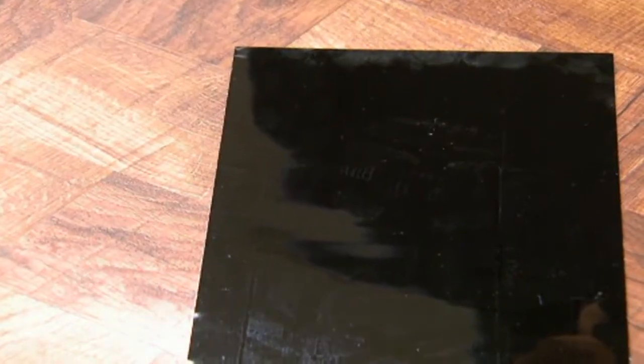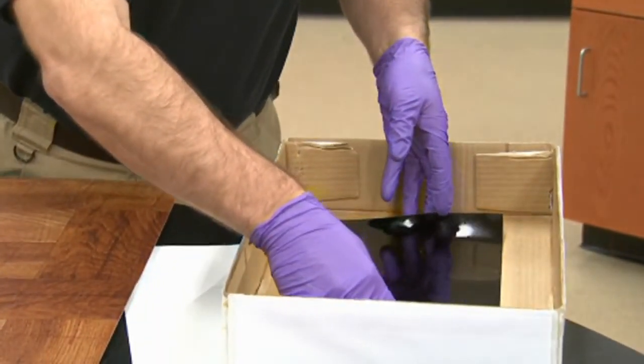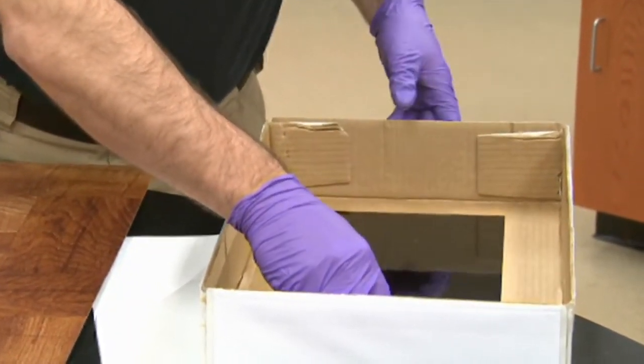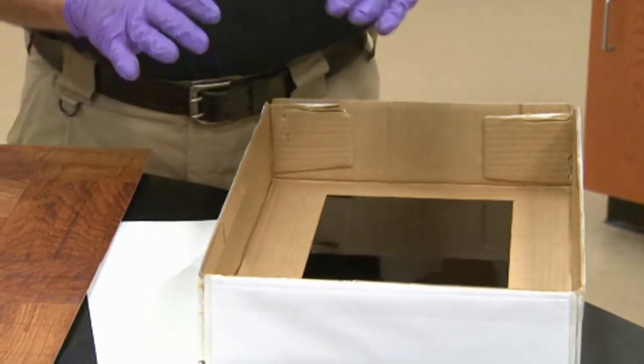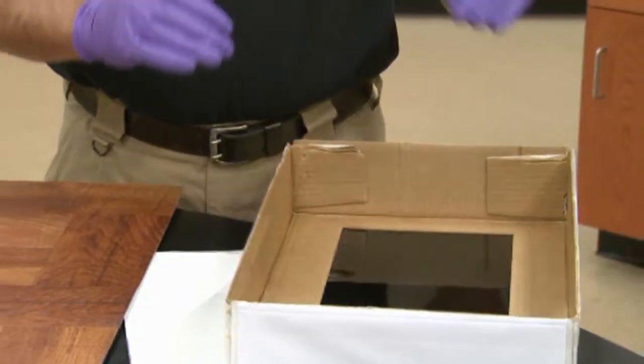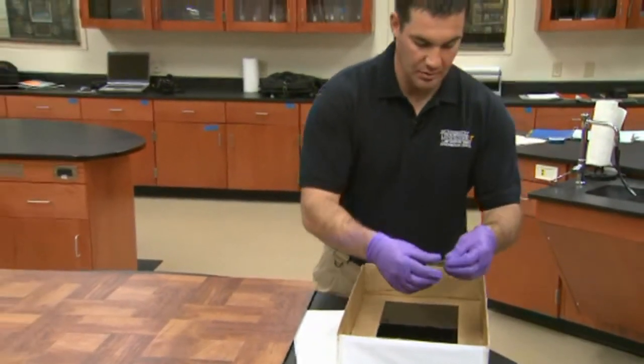It's difficult to see, but under the right light, if you get the oblique lighting, the footwear impression is present. So we're going to go ahead and package that. We want to keep the impression side up, and you can use a number of different packaging methods, but what's recommended is some sort of a shallow box that you can put it down into, and then it's best to tape the corners.